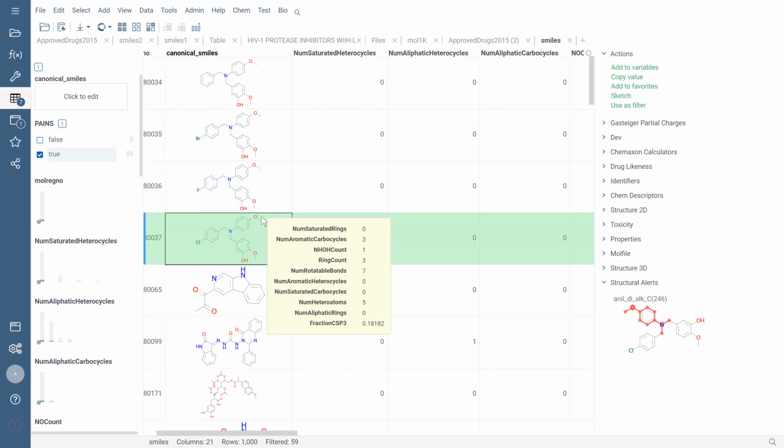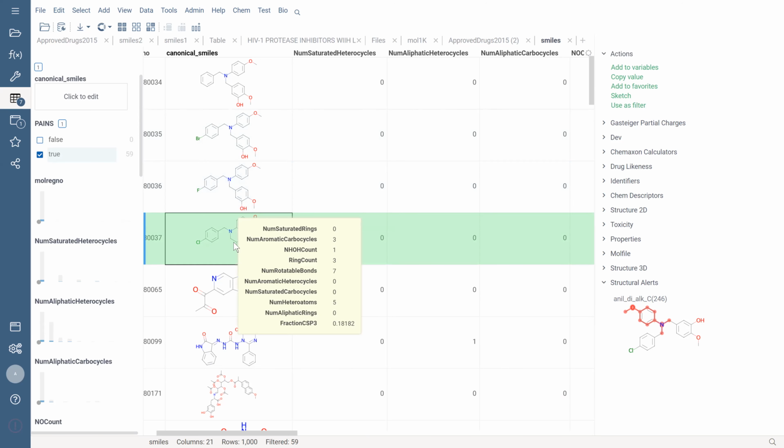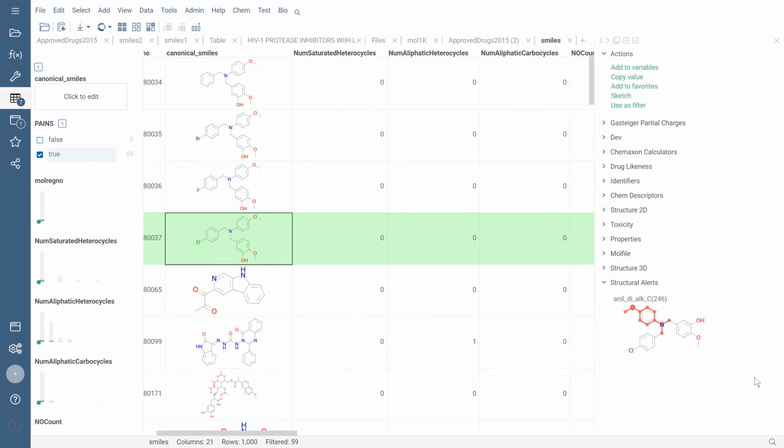That is required for calculations, as the internal RDKit cartridge works with SMILES, mol V2000, and mol V3000 to make calculations. So these formats we always support natively. No matter which format the molecule is defined in, the rest of the functionality will work. And others are converted on the fly to one of them.